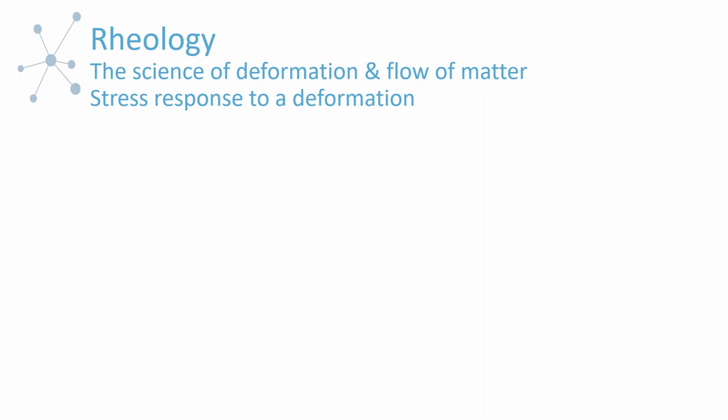The common definition of rheology is the science of deformation and flow of material. This is certainly true. However, a more descriptive term would be the second line item that I have here, and that is, what is the stress response to a deformation? An equally valid way of stating this would be, what is the deformation under stress? The idea is that when we're looking at rheological properties, we're looking at the relationship between stress and some sort of deformation.